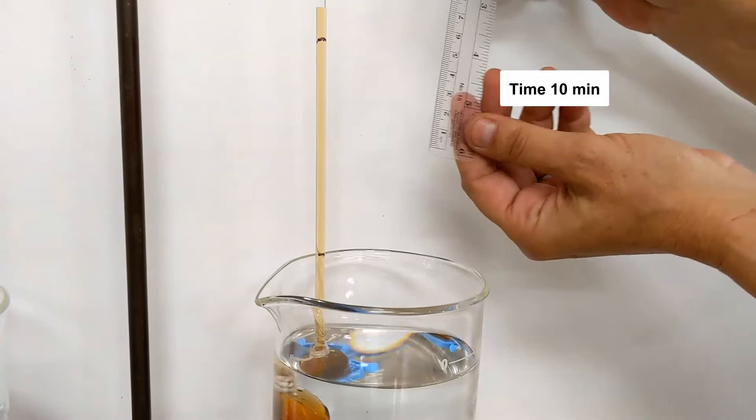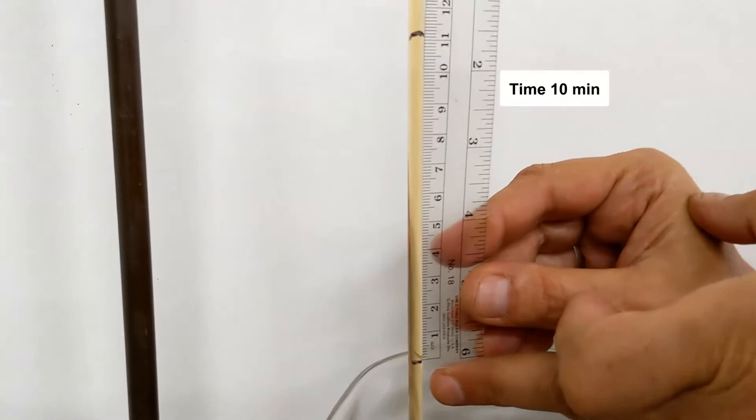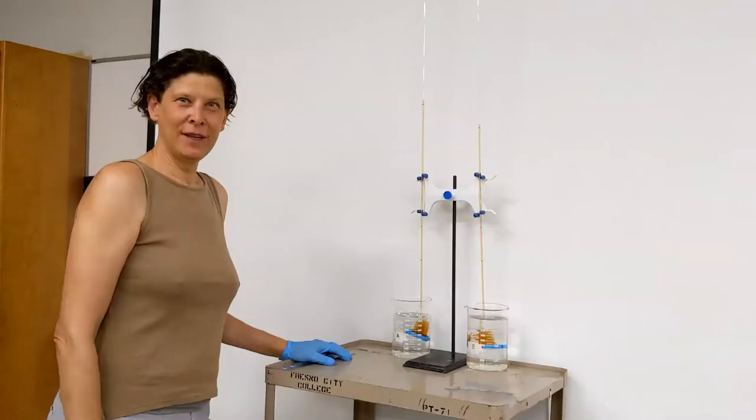For beaker B we'll do the same again. Metric system at zero for our initial and the top marking, that is 11.1 centimeters.